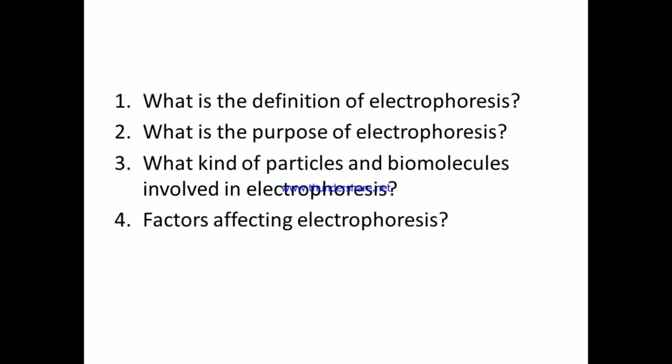What is the definition of electrophoresis? What is the purpose of electrophoresis? What kind of particles and biomolecules are involved in electrophoresis? Factors affecting electrophoresis.